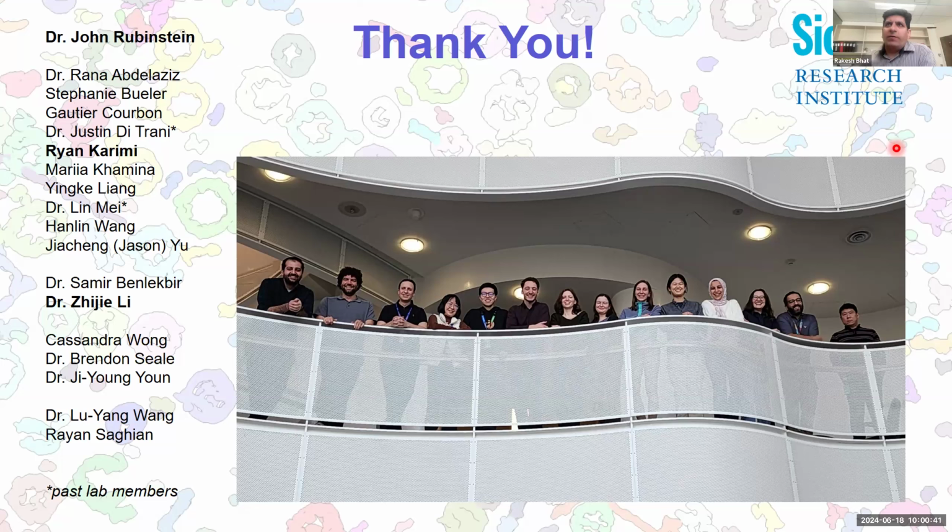There is a question from Irwin asking, what type of size exclusion did you use for the synaptic vesicles? Okay, so this was reasonably standard size exclusion. It was a Superose 6 10/300 column on an ÄKTA pure, which worked really nicely for separating the V1 from the synaptic vesicles and gave us a really clean sample.